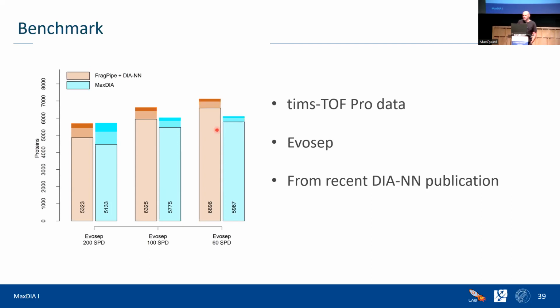So library prediction mode for phospho will also come, but at the moment it's highly recommended to use a measured library-based approach for phosphoproteomics. Okay. And is it possible to use libraries created by other tools like DIA-NN or Spectronaut and use them as a spectral library in MaxQuant?